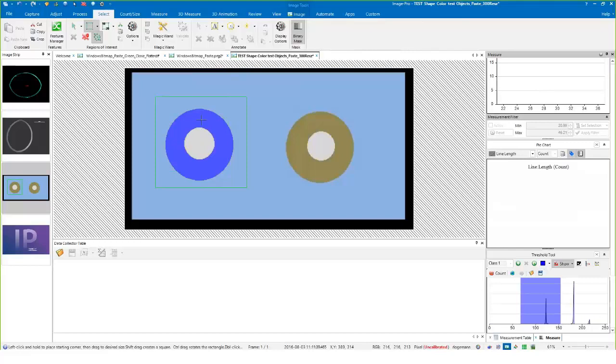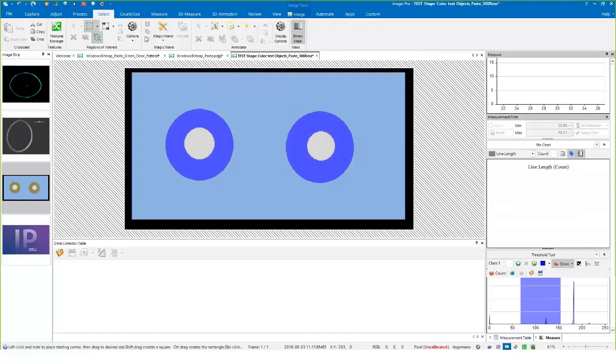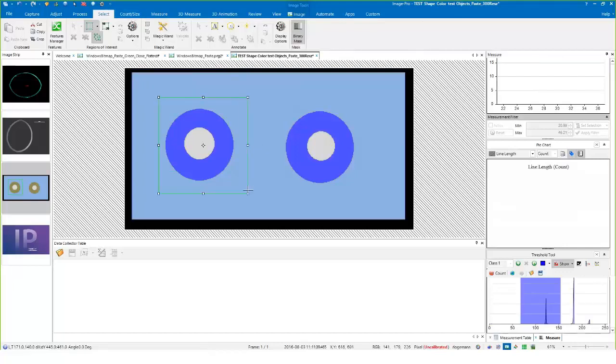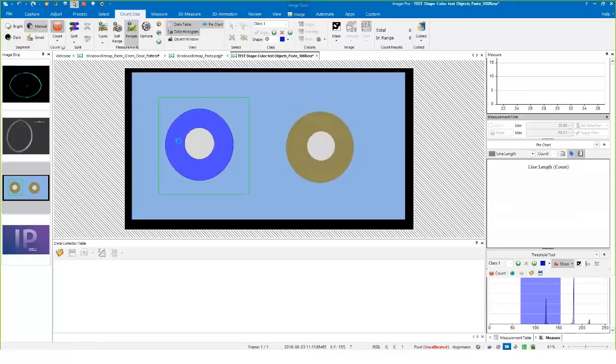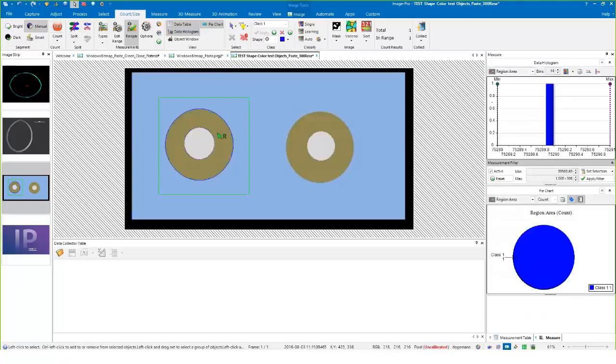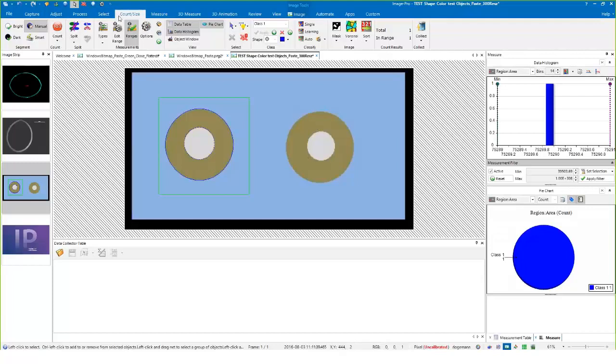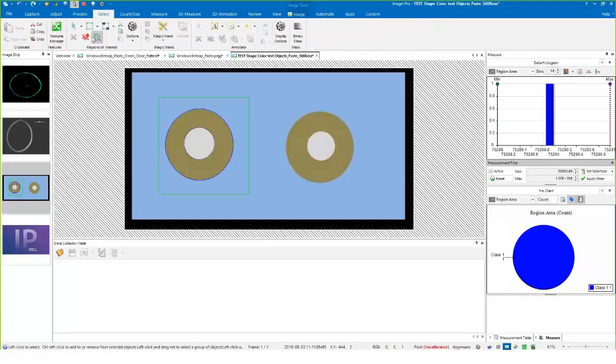Let me set my threshold a little bit better, it should just be the center area here. Now if I remove that region of interest, let me do my count. So now I've got my count for this object contained within the region of interest. I'll measure this other one secondarily.